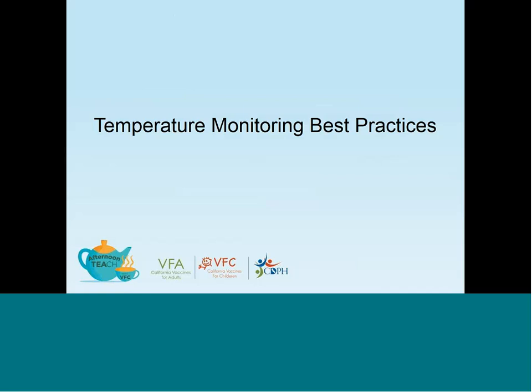Let's switch gears and look at temperature monitoring best practices. In this next section, we'll review best practices for monitoring temperatures.